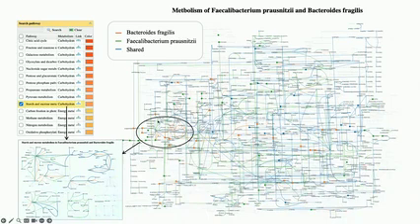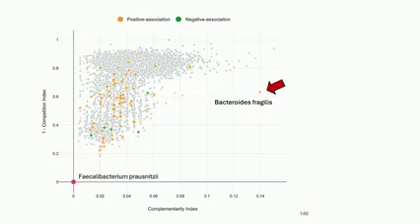Because there are two species, we can use two different colors. We can zoom in. This is really enriched for the complementary analysis, and you get the pathways out. It is starch degradation, and you can see there are a lot of complementary pathways. This is actually well documented. Not surprising, but for us it confirms that whatever we compute can help identify those complementary capacities in their metabolism.